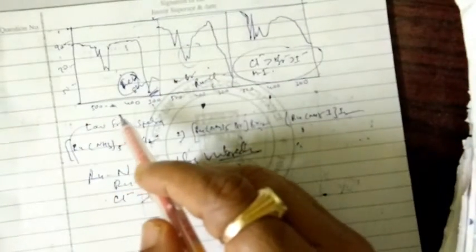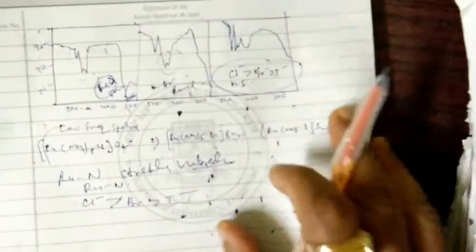The same ruthenium 3 complex is there, but the IR differs here. We have also seen the same complex for dihalides and how it differs, so IR spectroscopy becomes a very useful tool to determine the complexes.